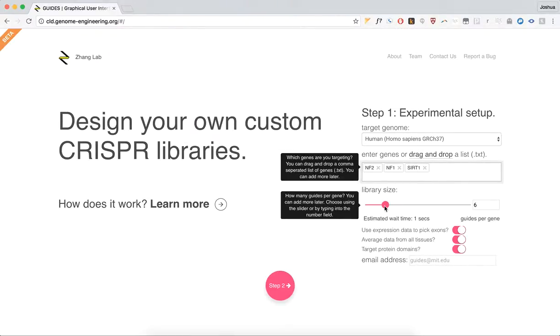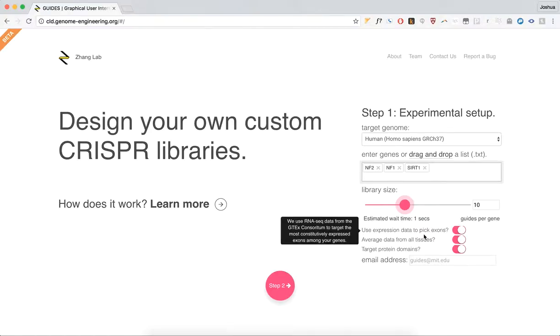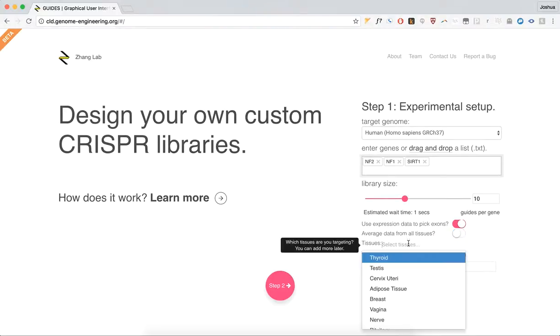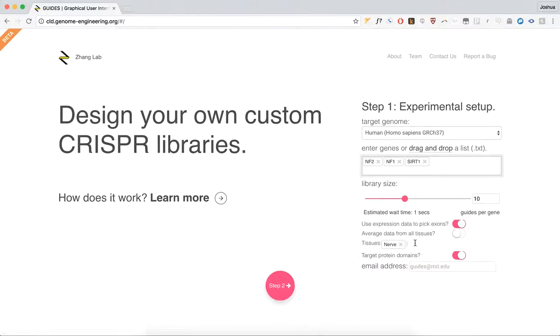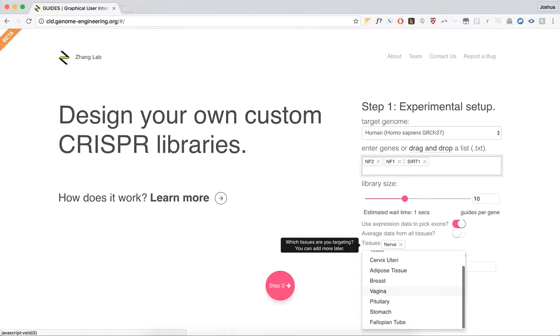Choose a library size, how many guides you'd like to target for each gene, and then you can choose your experimental parameters, such as whether to use expression data to pick exons, whether to average data from all tissues. In my case, I'll choose nerve, and I'll choose brain.